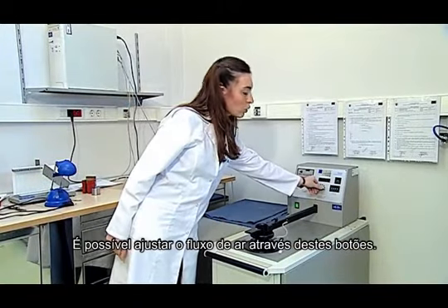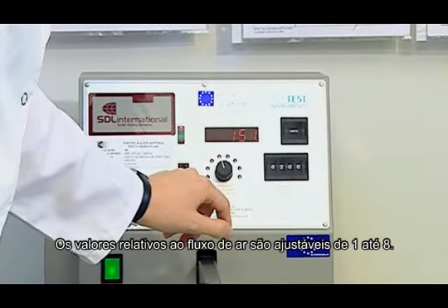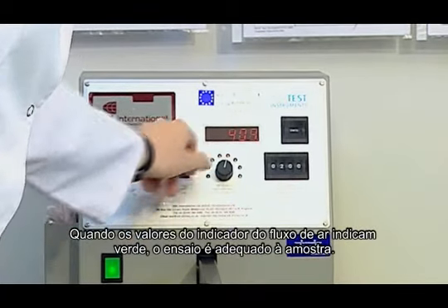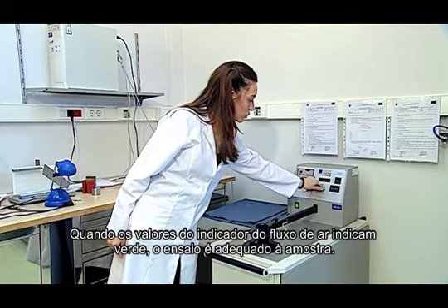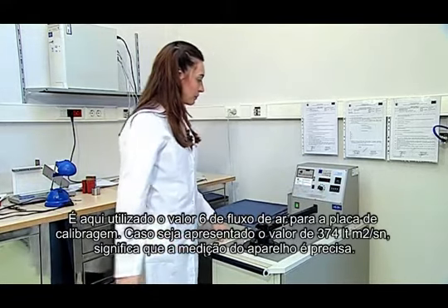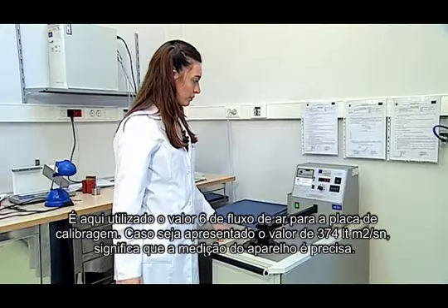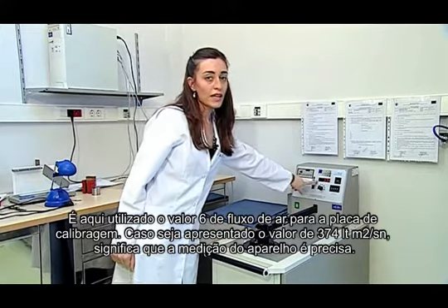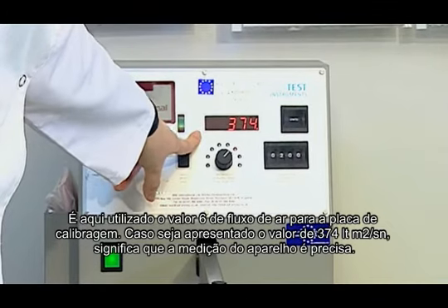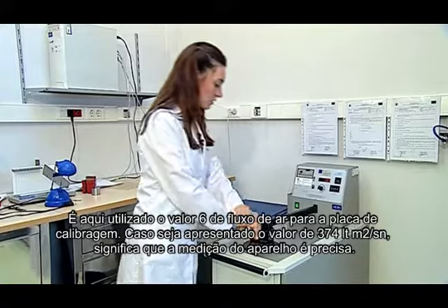I can adjust the airflow with the buttons here. Airflow values are adjustable from 1 up to 8. When the airflow indicator values show green, the test is appropriate for the sample. We use the 6th air flow for the calibration plate, and if it shows a value of 374 liters which pass through a square meter per second, it means that the device measures accurately.